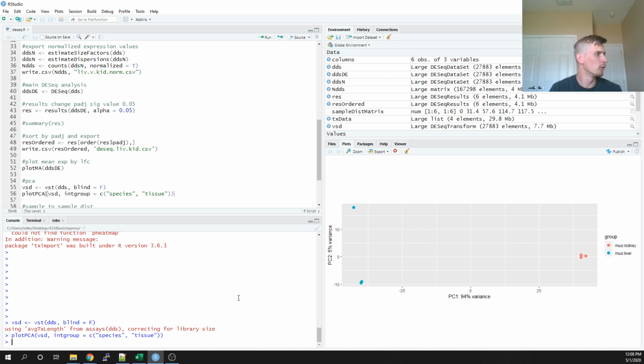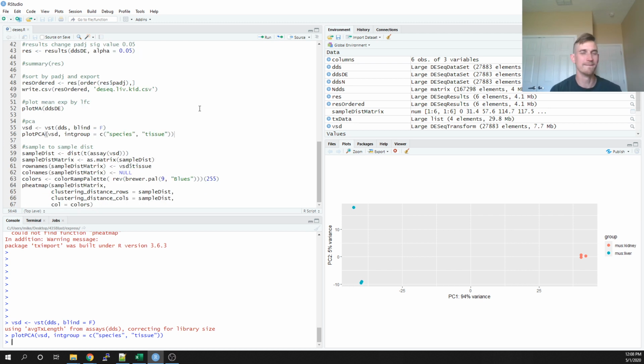And so the other one that we'll work on, based off of what's available in the DESeq package, is comparing, kind of measuring the distance of these data sets, in a similar way that we can estimate a distance between two nucleotide sequences. We just compare expression values for every single gene and measure pairwise distances for all of those genes, and then come up with an overall mean distance of those values.